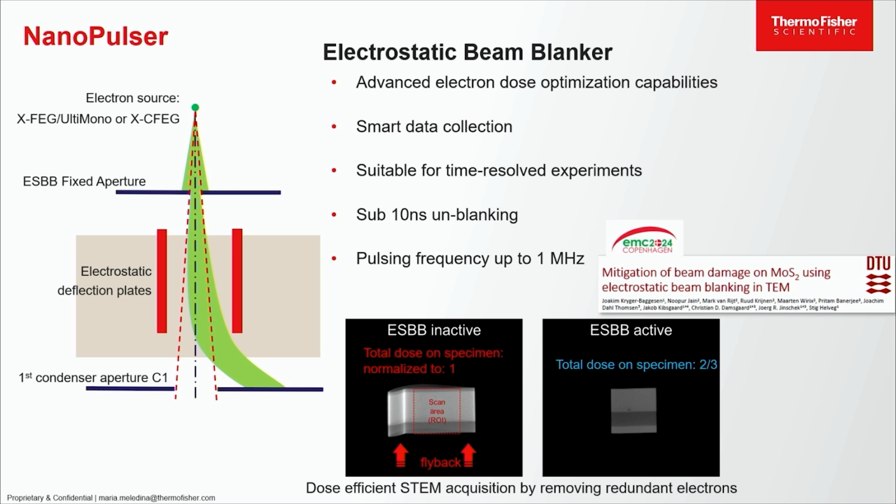What I also really like is the work which we did with DTU, with the group of Stig Helveg, when we were looking together at molybdenum disulfide using the pulsed and unpulsed mode. And we found really cool stuff, that it really matters for the dose mitigation. We are still in the process of analyzing and digesting it, and soon we'll submit for publication.